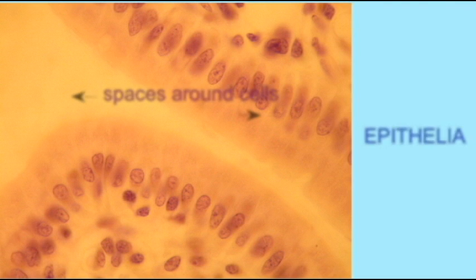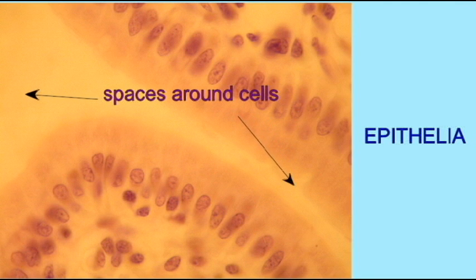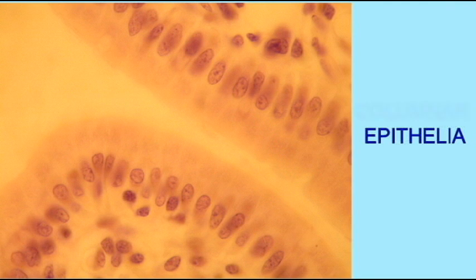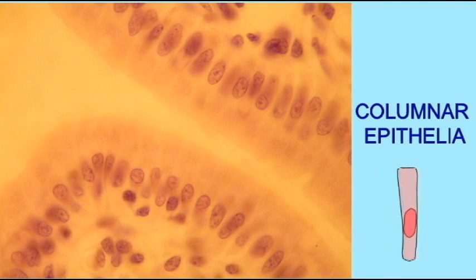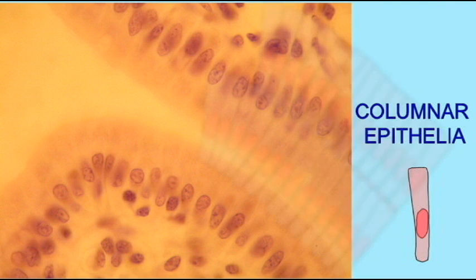This image is of simple columnar epithelia of the small intestine. It is epithelia because you can see the spaces around the cells. This is the lumen of the small intestine, and epithelia line the tracks which exit the body. These are columnar cells — they are tall and rectangular, and their nucleus is elliptical, or oblong, instead of being circular.